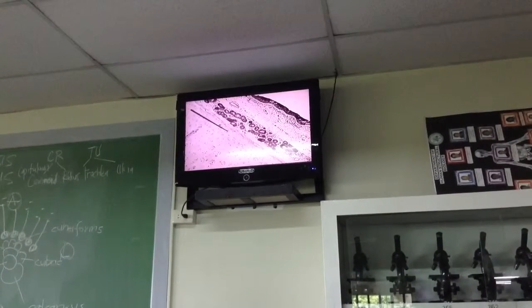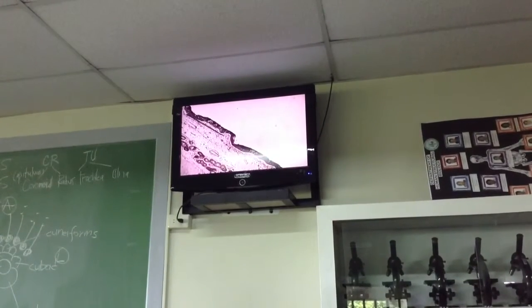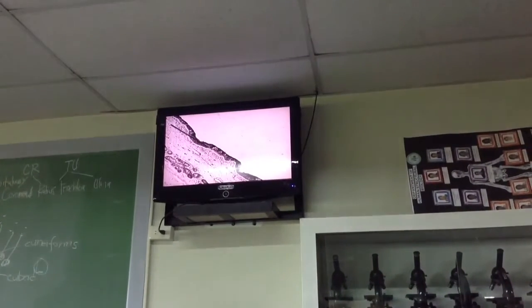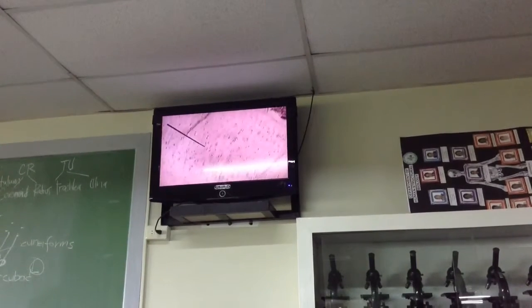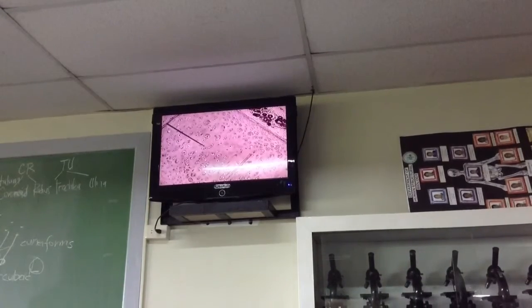Hindi po testis. Trachea. This is the mucosa with the lining epithelium, pseudostratified, columnar, ciliated with goblet cells. These are the tracheal glands, but our focus today would be on this one, the cartilage. This is called a hyaline cartilage. So fundamental tissue type is still connective tissue, like all the other cartilage and bones that we'll be showing today.